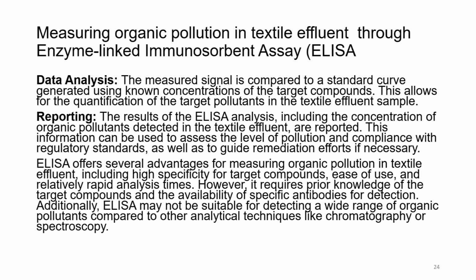Data analysis. The measured signal is compared to a standard curve generated using known concentrations of target compounds. This allows for the quantification of the target pollutant in the textile effluent sample. Reporting.